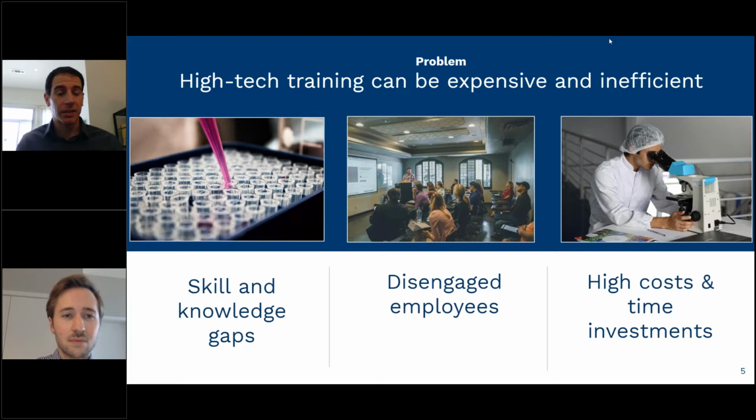And then of course there's hands-on training, and that can be really important, but there are limitations with hands-on training, right? The time that you can spend, what you can physically do with different solutions or reagents, or trying different things out. It's a walkthrough, but again, go back to the pilot example. Pilots train on actual airplanes, and they also train on simulators, because simulators are something they can use to really get up to speed quickly and learn rapidly in a different environment.